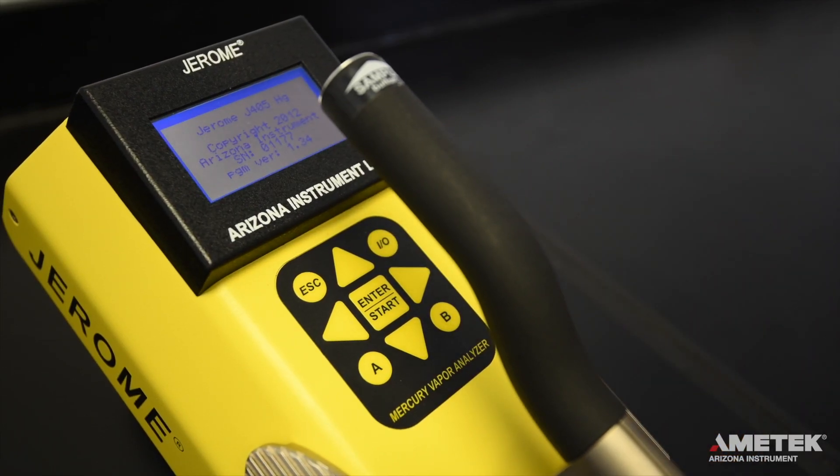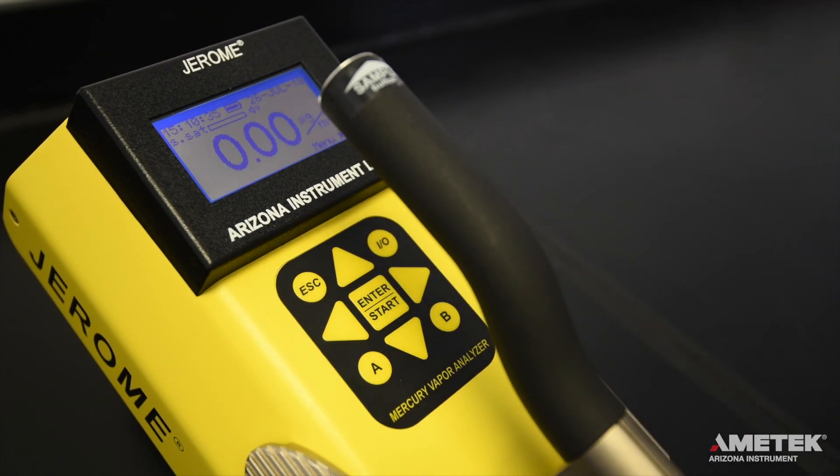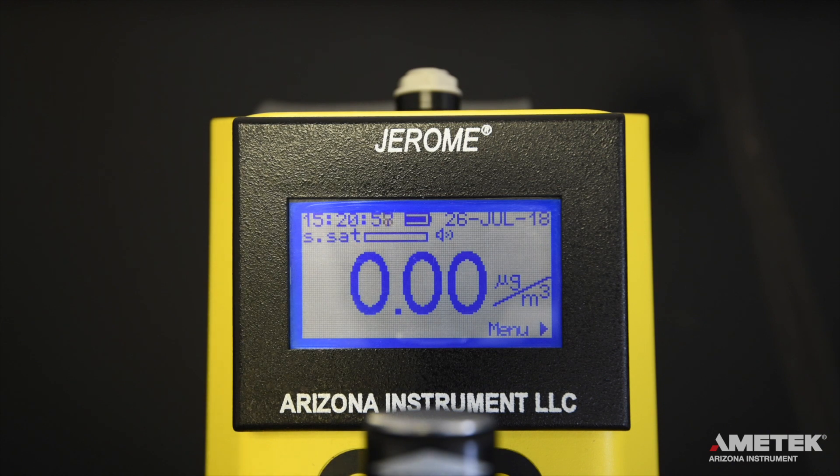After you have verified that you've received everything on your packing slip, simply turn on the instrument by pressing the power button. If any calibration reminders appear, simply press the escape button to return to the main screen. The display should read 0.00 micrograms per meter cubed. On the main menu screen you will see the date, time, battery life indicator, test result, result units, sensor saturation meter, and menu link.